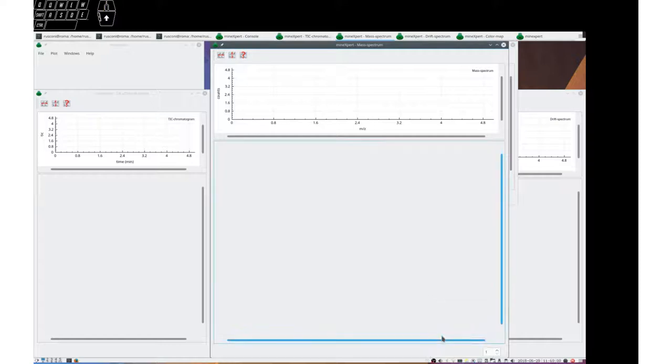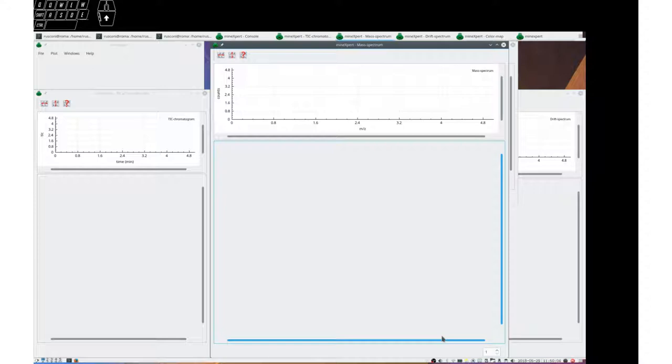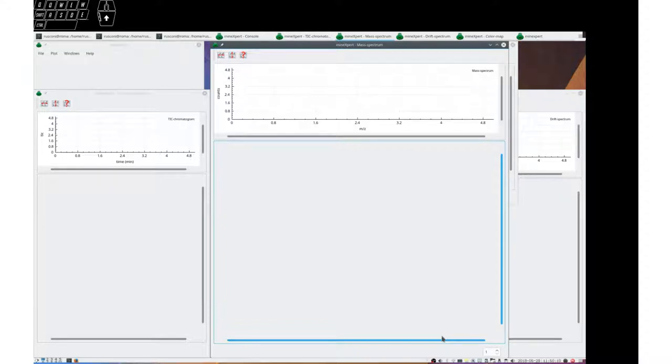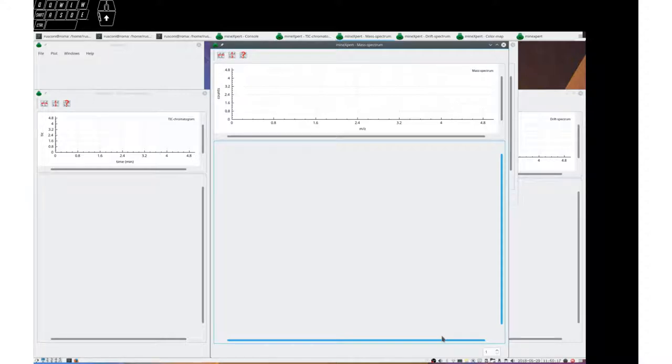Greetings. This video is about configuring MZ integration in the mineXpert software from the msXpertSuite development project.